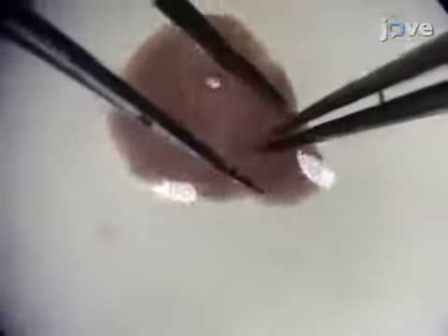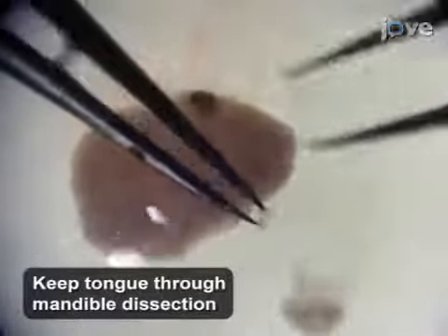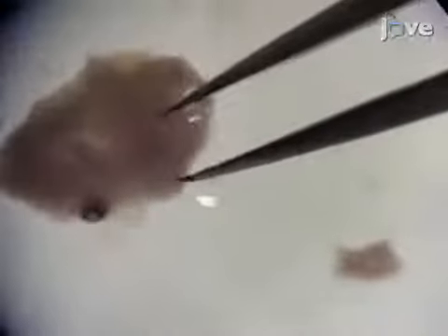Remove the mandible carefully without damaging the palatal shelves. When the mandible has been detached, carefully remove the tongue and confirm the presence of a robust reporter signal in the midline epithelial seam. It's important not to damage the palate explant during dissection, to keep the midline epithelial seam intact.